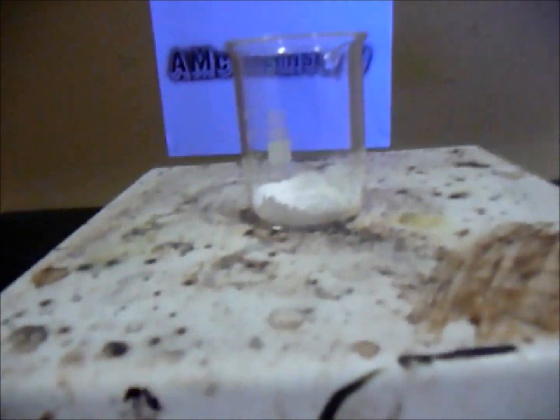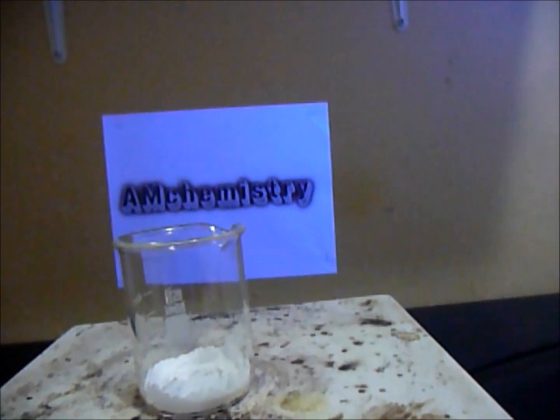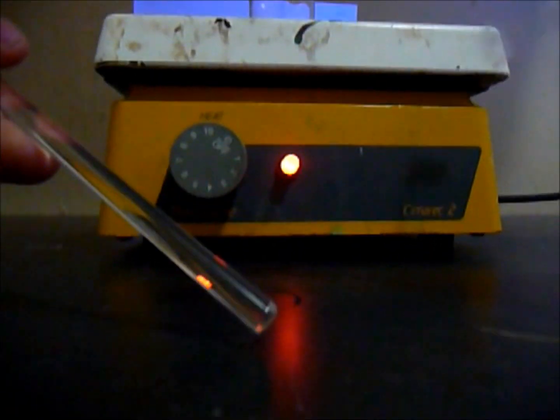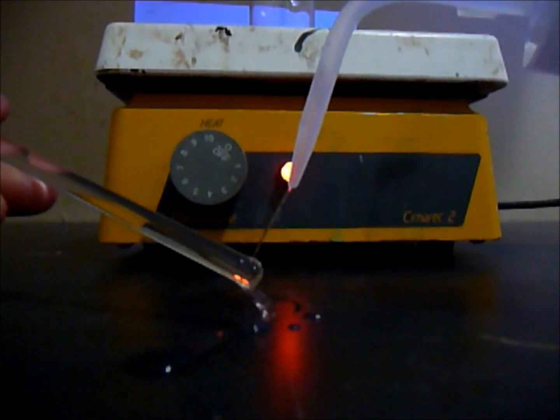It's been about 10 minutes, and I'm not sure if it's ready. But a quick test to know if it's ready: get a stir rod and wet it with DI water, like this.